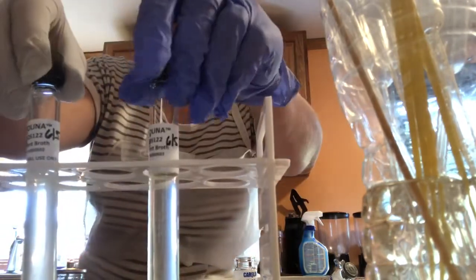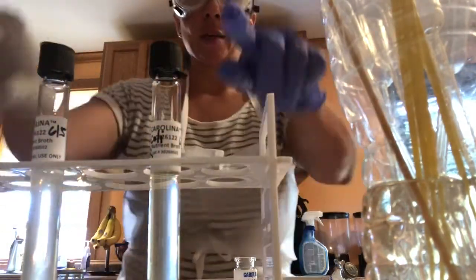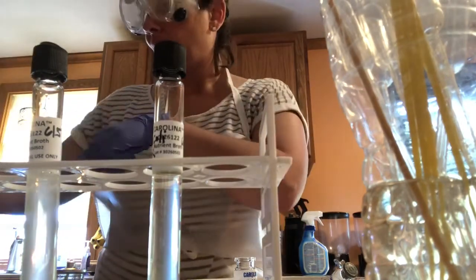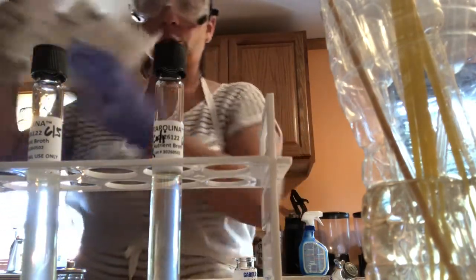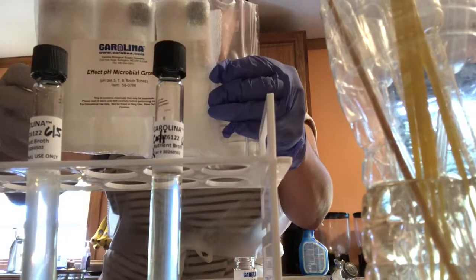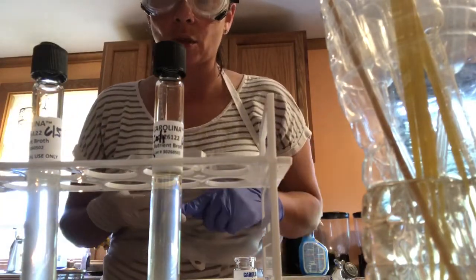So now I have my Staph Epi and my E. coli, so it's Friday afternoon. These guys are going to sit probably until Sunday, when then I inoculate the water activity, right? So make sure you have this handy, the water activity vials, the effective pH on microbial growth, and then those 3 EMB, McConkey, and mannitol salt agar plates.